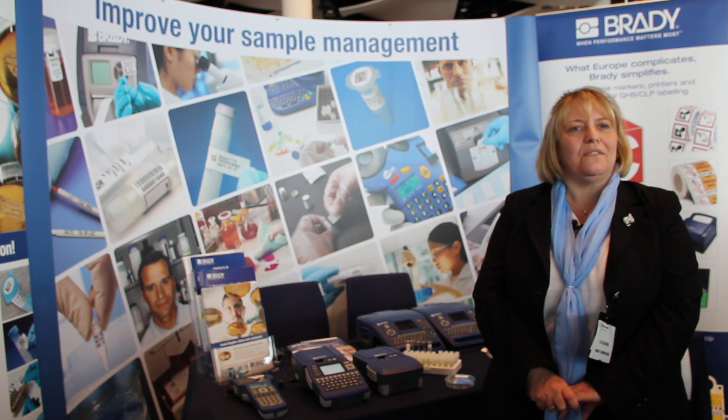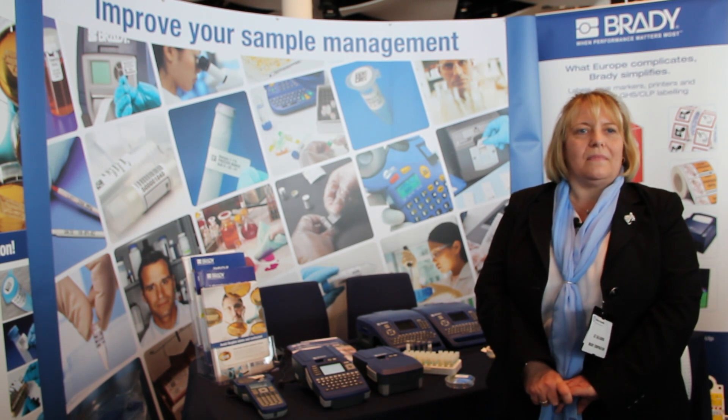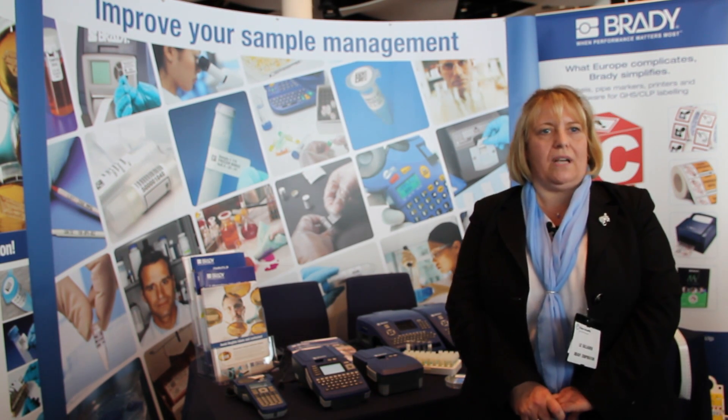There's a full range of labels for slides, vials, tubes, well plates, tissue cassette labelling — a whole range of laboratory identification, including some symbols and some safety products as well.